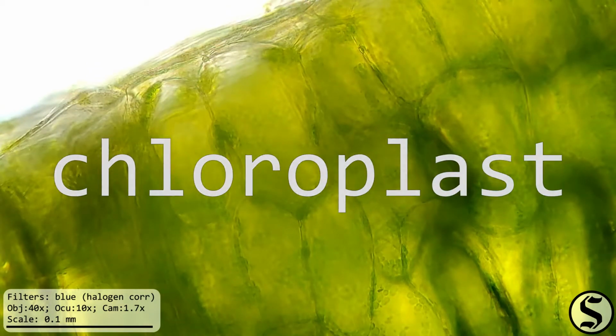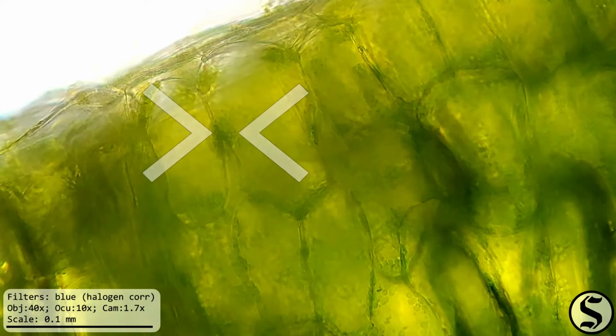And chloroplasts are those little green dots. That's from the Greek chloros for green and plastos for formed. And that's where the plant does its sunlight processing. I think it's interesting that they form those little clusters in there.